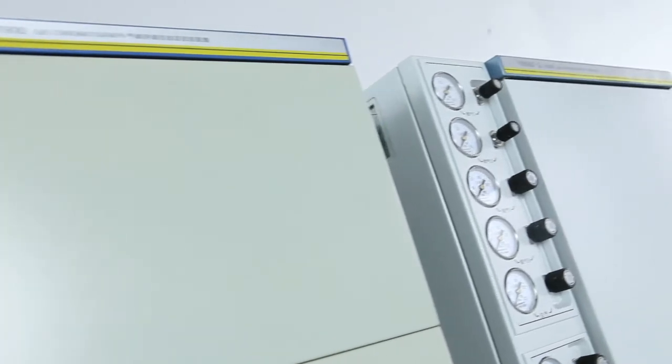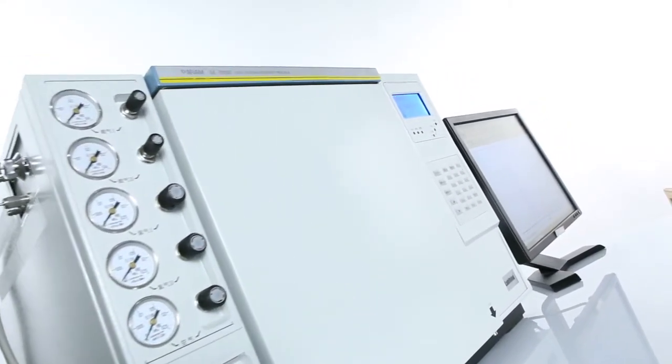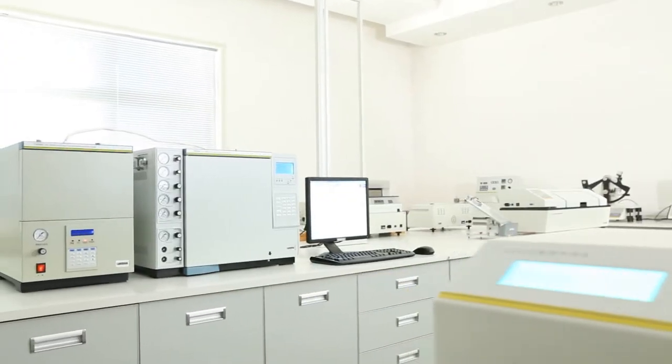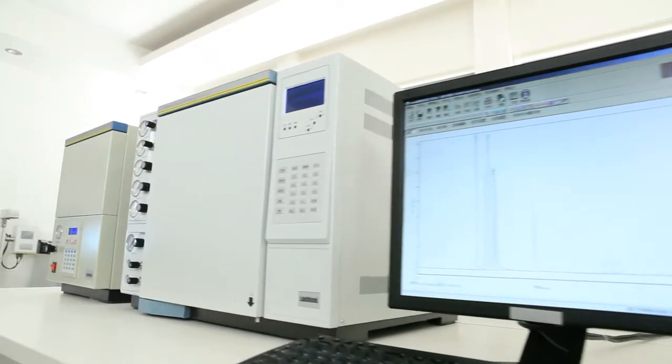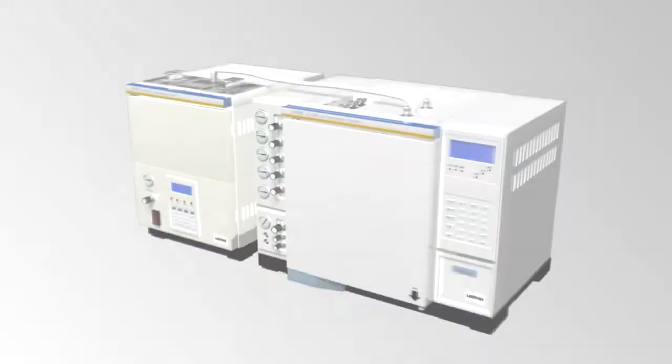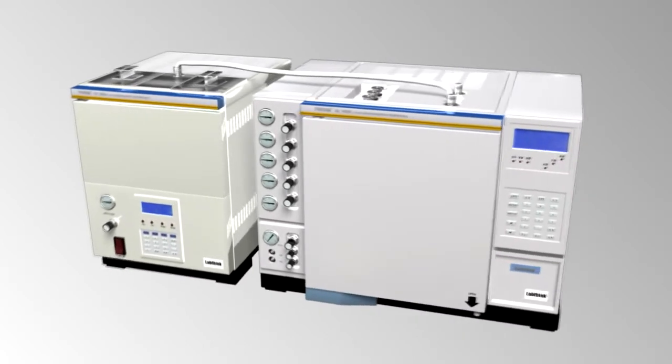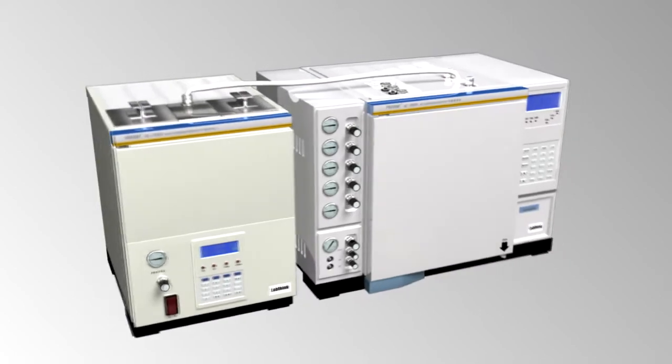The GC7800 Automatic Organic Solvent Residue Analyzing System is LabThink's latest gas chromatography system, designed for measuring the quantity of organic solvents left on printed packaging products. The system consists of an auto sampler and a GC7800 gas chromatograph.